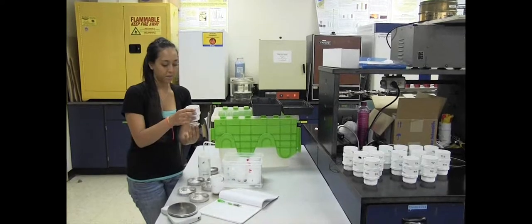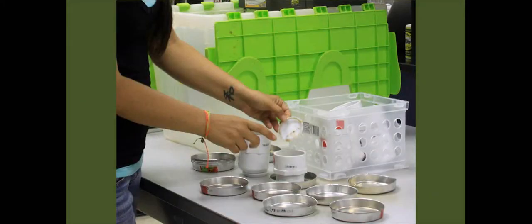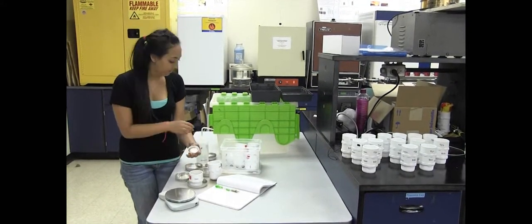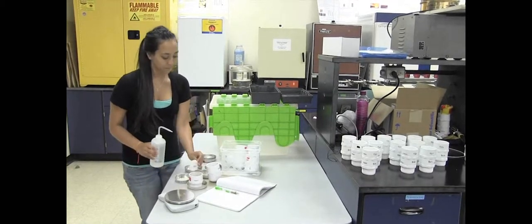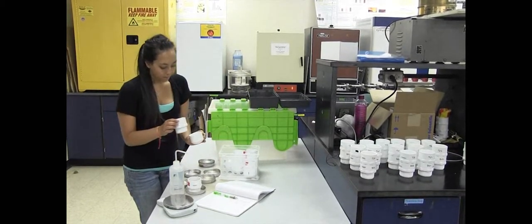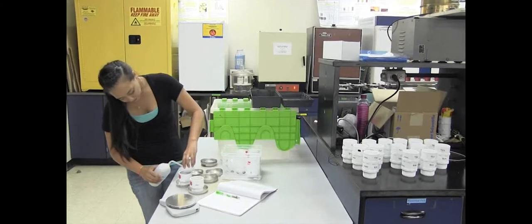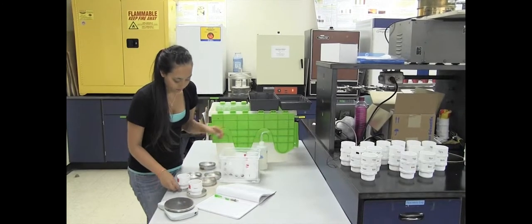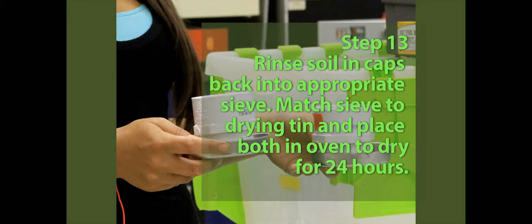As you can see there's some soil that has fallen through from traveling from the field to the lab, but this stuff that has fallen through is considered to be with the 250 micrometer sieve — the soil just got disrupted in the traveling. So just use a little bit of water with your squirt bottle and go ahead and rinse as much of that back into the sieve as you can. Do the same with our 53 micrometer sieve — as you can see in here there's still some soil, so again just use the wash bottle and try to get all of that soil back into the sieve. Then once you do that you can go ahead and put your sieves on our drying tins in the oven for about 24 hours until the soil is completely dry.